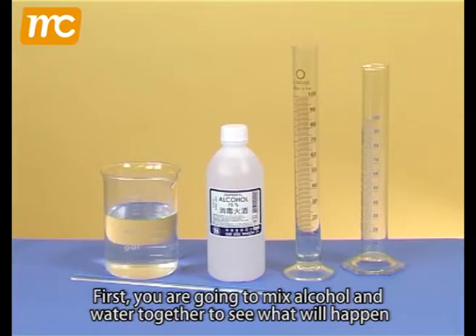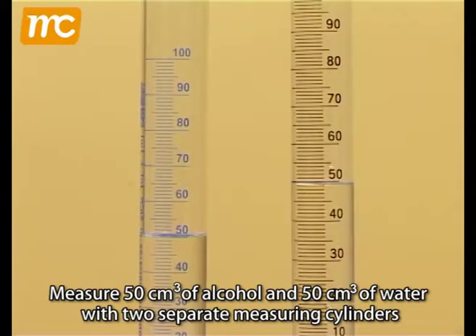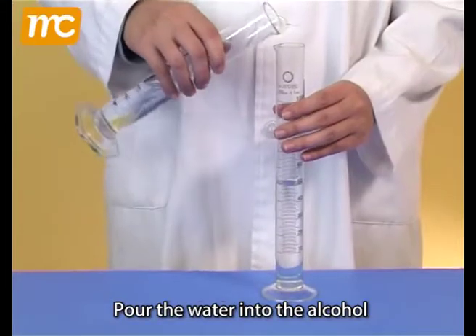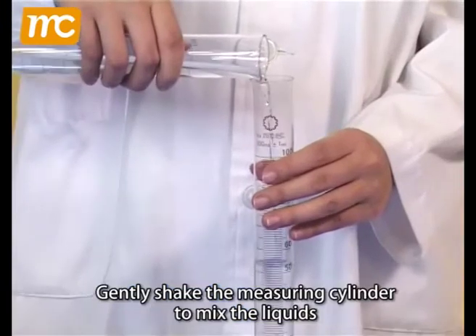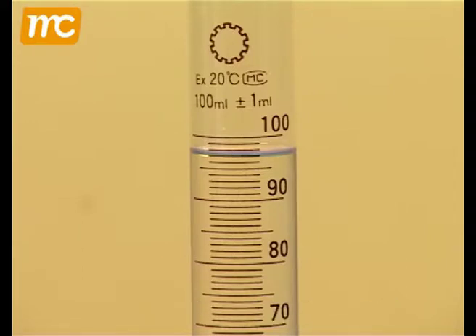First, you're going to mix alcohol and water together to see what will happen. Measure 50 cubic centimeters of alcohol and 50 cubic centimeters of water with two separate measuring cylinders. Pour the water into the alcohol. Gently shake the measuring cylinder to mix the liquids. Record the volume of the mixed liquid.